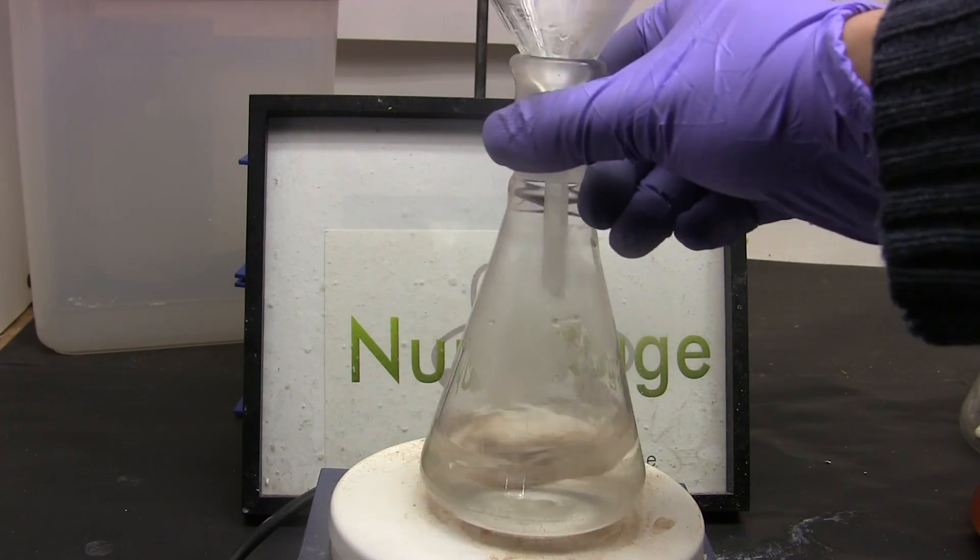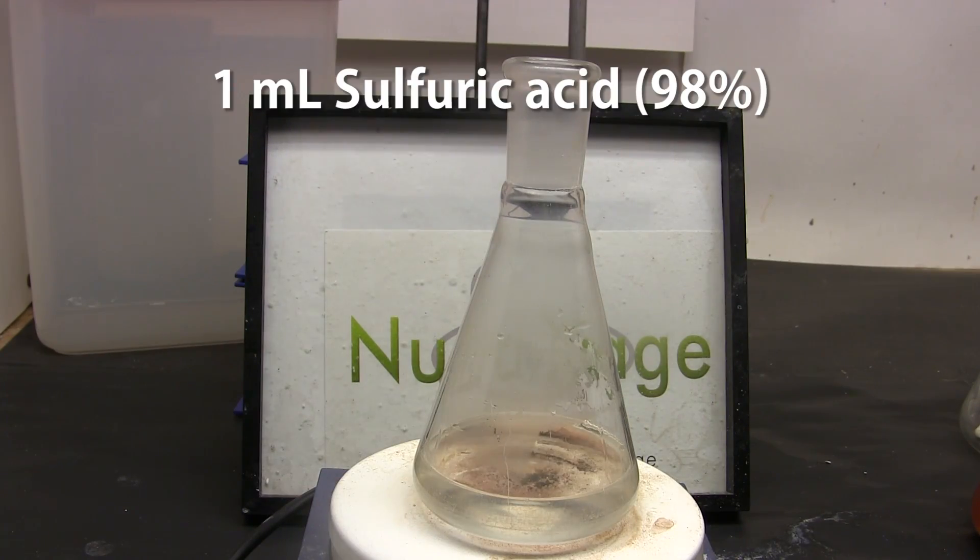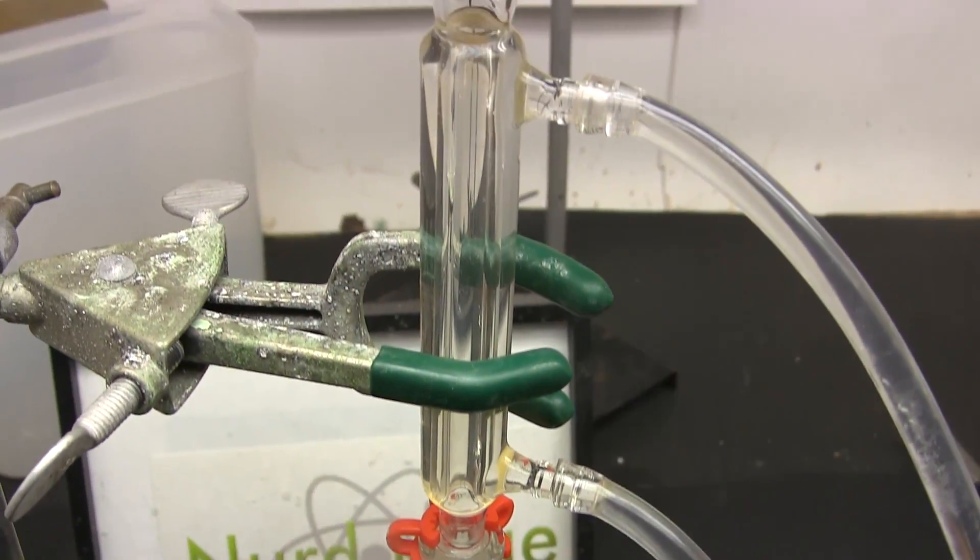Finally we need an acid catalyst and we'll use 1 mL of concentrated sulfuric acid. Now we set up a reflux apparatus on top of the flask.